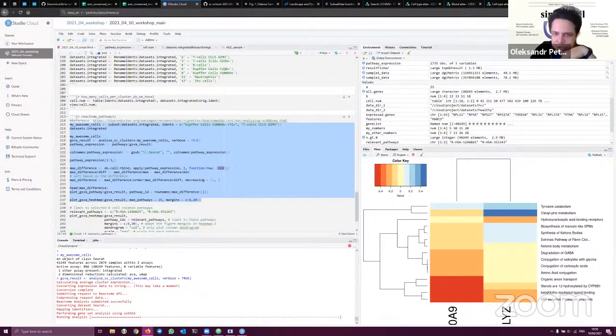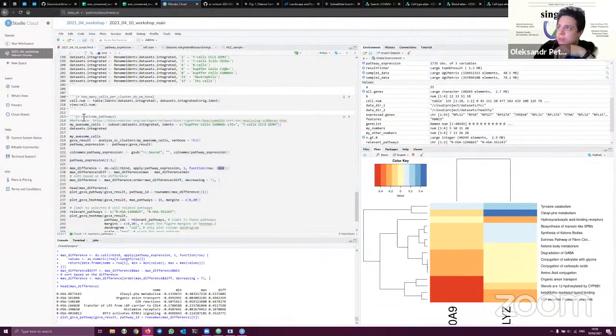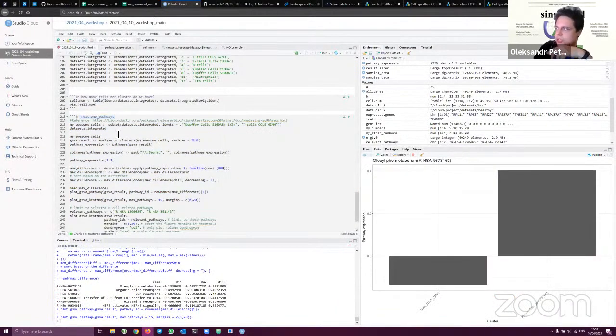And there was also a discussion regarding the ranking. So again, it's not about the genes, but about the pathways in this case. And when it prepares the pathway ranking, the enrichment ranking, of course, it takes into account the expression of all the genes in the pathway. However, again, what's the name of this? It's gene set enrichment analysis.